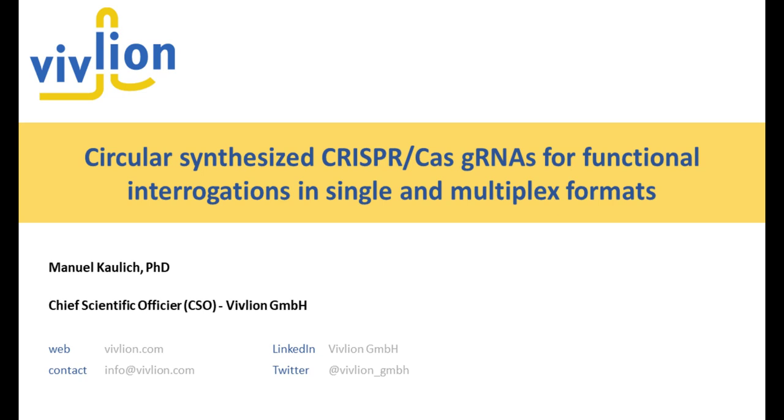I will be presenting circular synthesized CRISPR-Cas gRNAs for functional interrogations in single and multiplex formats for you today.